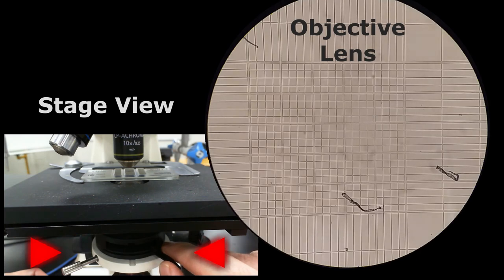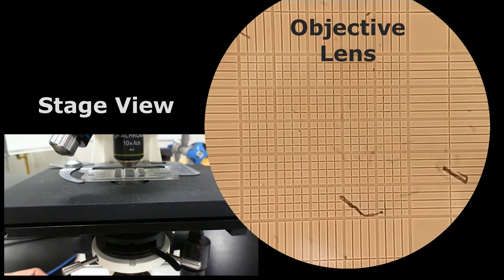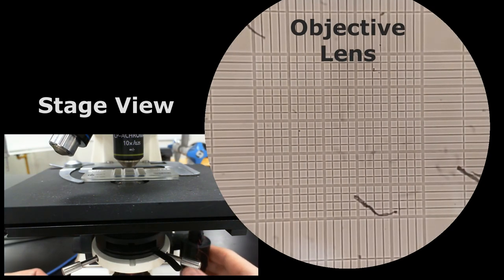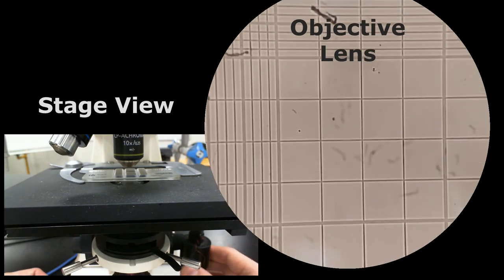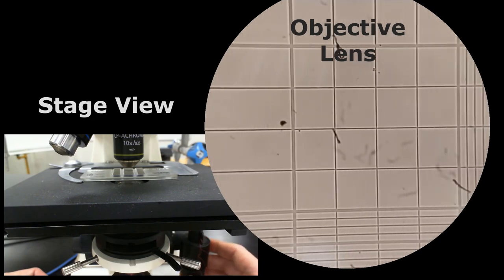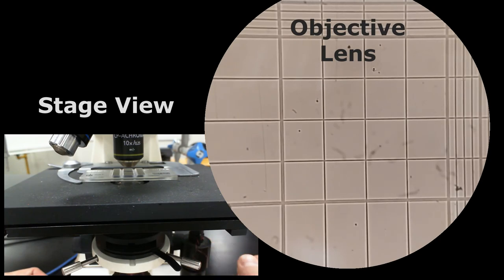So again, you can use both of these chambers and you will be able to see things fairly well, but it's much easier with the other one. It's much more polished. This one, again, the same idea: here's the center square, and then you have the sides. But with these chambers, you do need to make sure you increase your contrast significantly in order to be able to see the lines on your slide. And again, you do that by using this slider here.